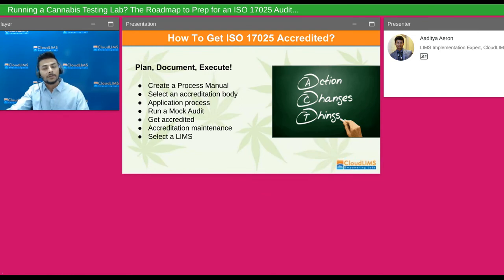So now comes the part where I can actually talk to you about how you can start with this process. So you know about what the accreditation is, why it is really important, how you achieve it, and maybe you can utilize a LIMS there. But now really, how do you get to the very basic of beginning? What do you do tomorrow after this talk is finished? What can you do?